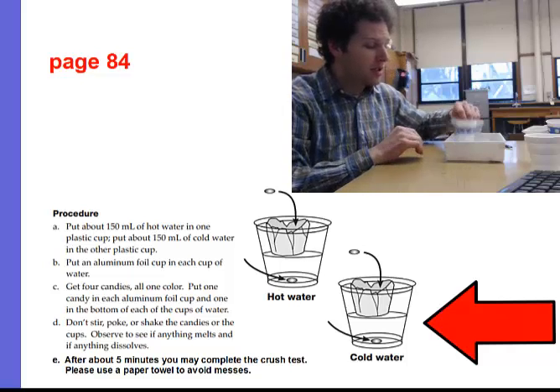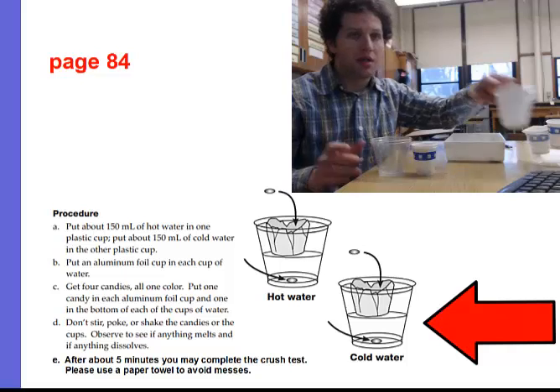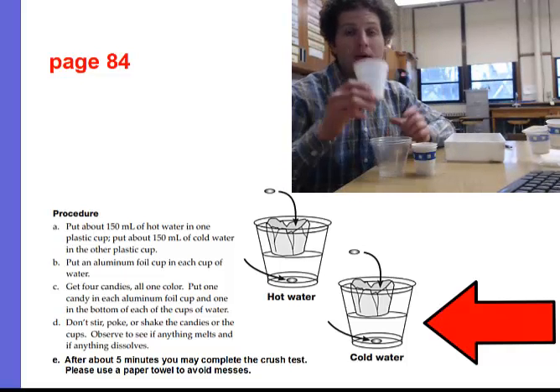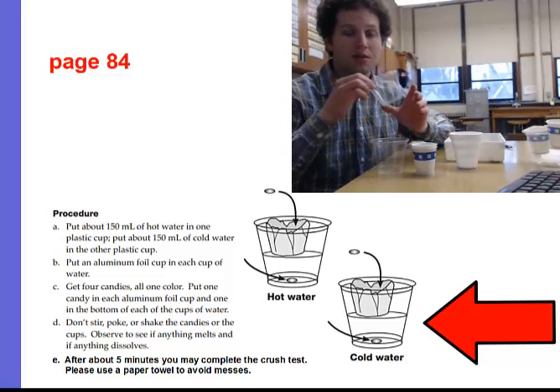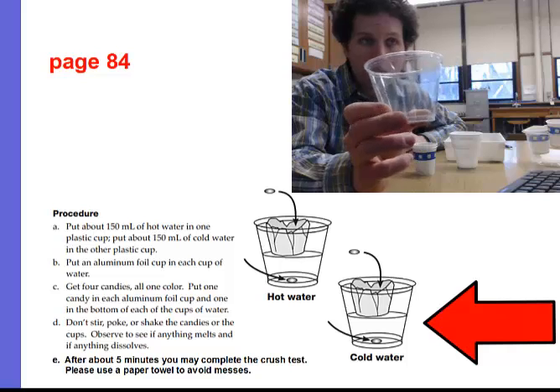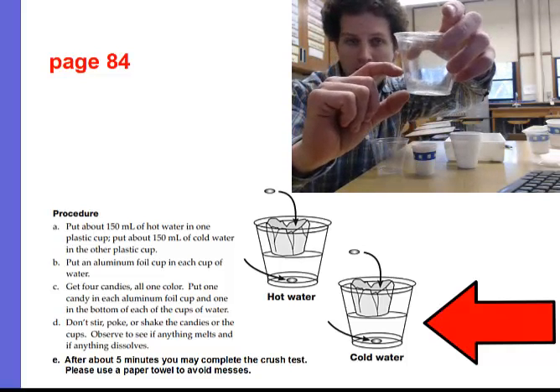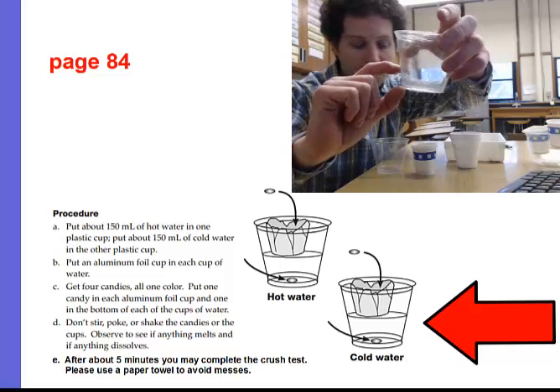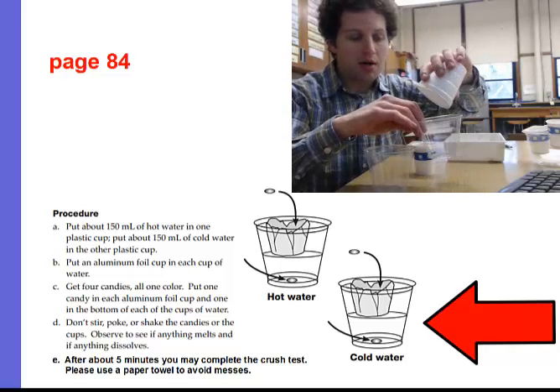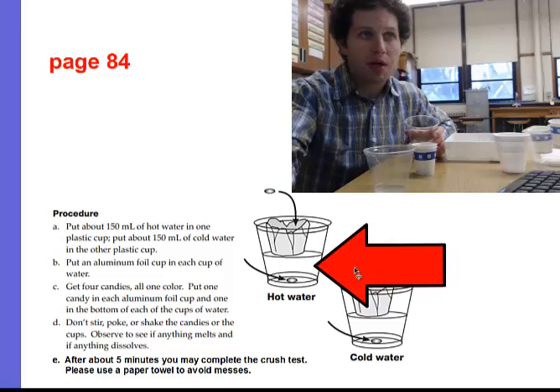The first lab, you're going to have a setup with some plastic cups and Dixie cups. First thing you'll do, get yourself a styrofoam cup and get some hot water. Also, fill up a small amount of cold water into one of the clear plastic cups. You don't need that much, just the bottom third of the cup of cold water should be fine. You'll put your hot water into one cup, cold water into the other cup, just like you see in the picture.